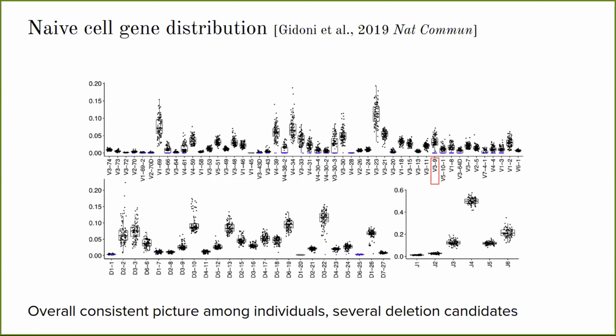So either it was deleted from the chromosome, or there is a different issue. Those genes were suspected to be deleted. What we did next was go back to the chromosome and sequence the area of this gene to see if it is in fact deleted.